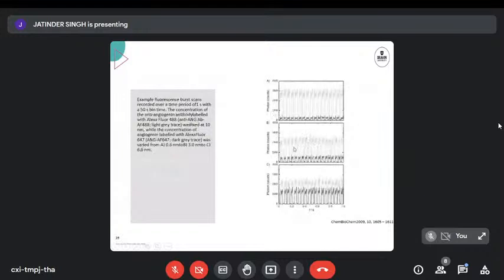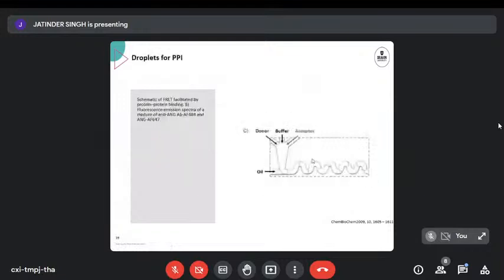So the y-axis here are the values measured for the peaks, with that difference that here there was not a lot of pipetting going in, a lot of solutions taking place, but simply the ratio of the solutions between our donor and our acceptor solutions were changed and mixed with buffer to keep the concentration constant. So the total volume of these droplets was always the same. By changing one, you change the other in the same respect, and you get the same target being present in the volume.